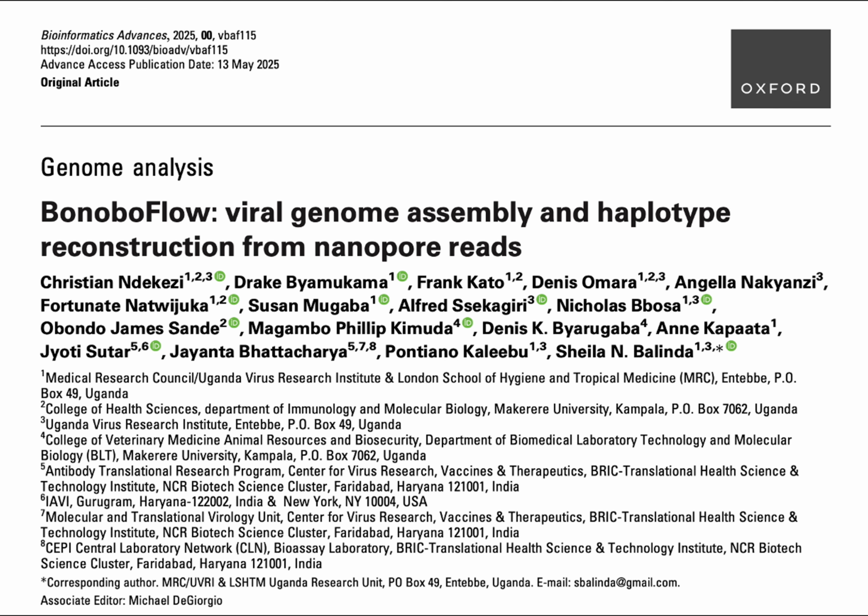High accuracy, then. Were there any key differences or limitations found? Yes, some interesting points emerged. For instance, some of the benchmark tools like Accuvir and another called Genome Detective sometimes struggled to produce separate consensus sequences for all the individual strains put into the simulation. They often just generated one overall average consensus. So they missed some of the diversity. Potentially yes, in those simulated scenarios.